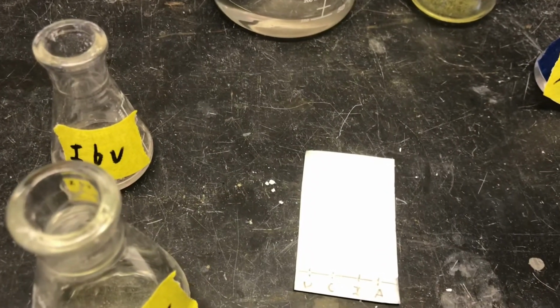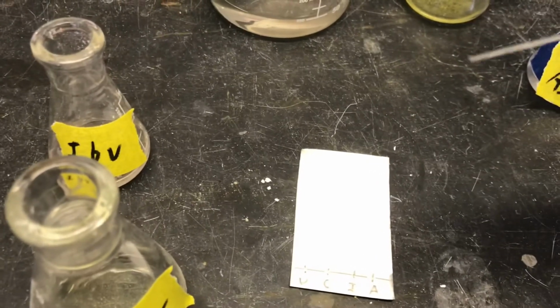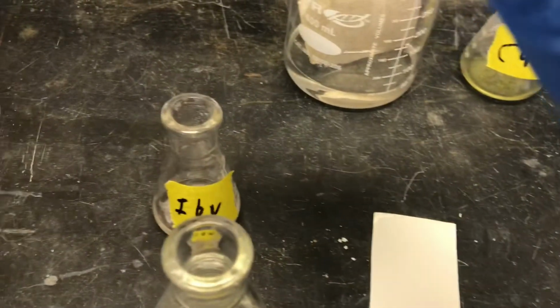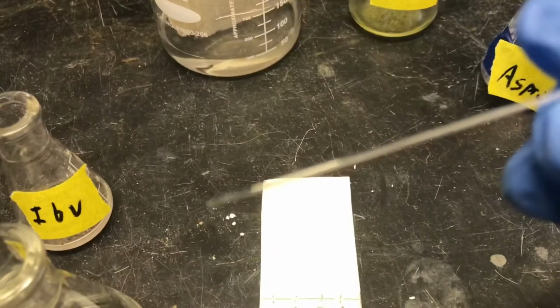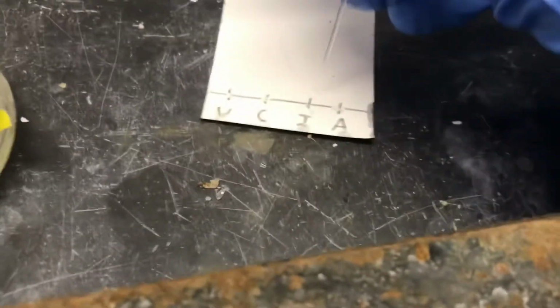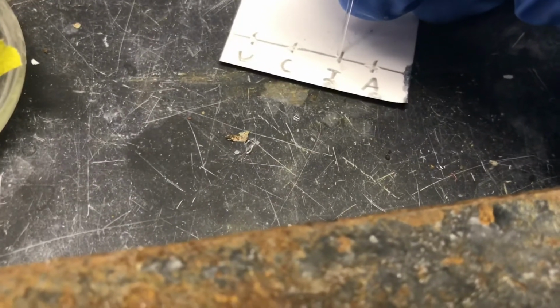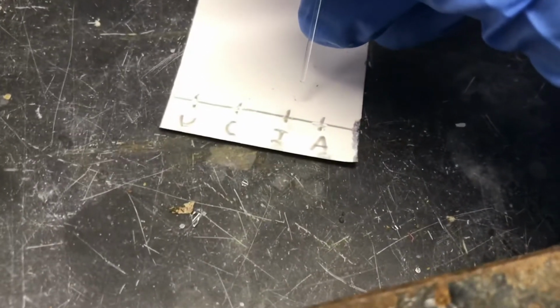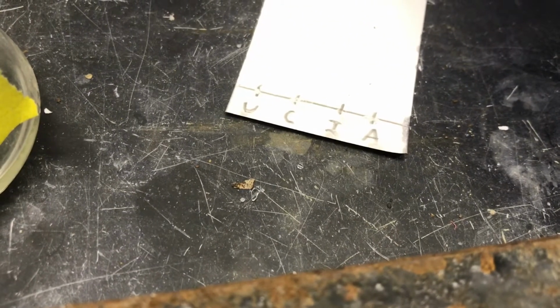Alright, I'm going to real quickly demonstrate how to successfully transfer the substance onto the TLC plate. First, get this capillary tube and dip it right into your sample. Some of the liquid is going to go up via capillary action, and you're going to want to press the tube right on the line where your dash is, and you're going to see hopefully a little circle of moisture right there, just about that big. You can still kind of see it. That is about the perfect amount to get on the plate.